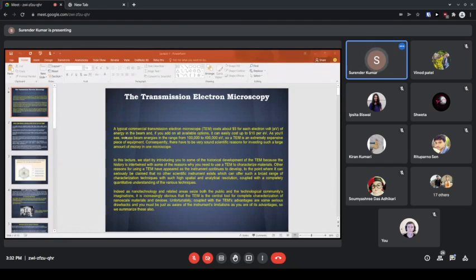And in TEM, we can approximate the best resolution using an expression similar to this relation, which is simply resolution equal to 1.22 lambda upon beta. So if you know the wavelength of electrons, for example if you have a 100 kilo electron volt electron microscope which can accelerate electrons to such high energy, you can simply calculate lambda and then the resolution. We will see it later.